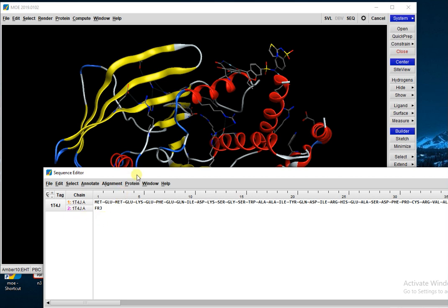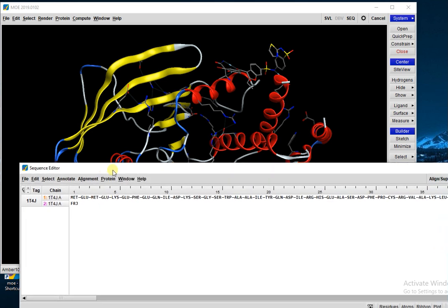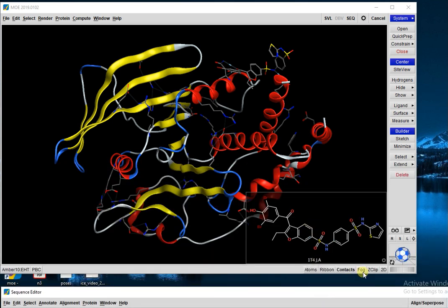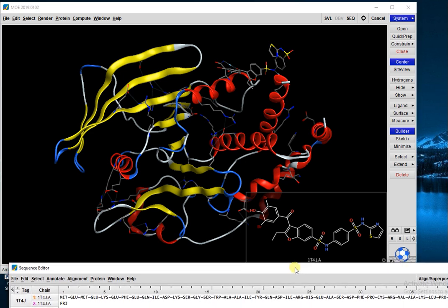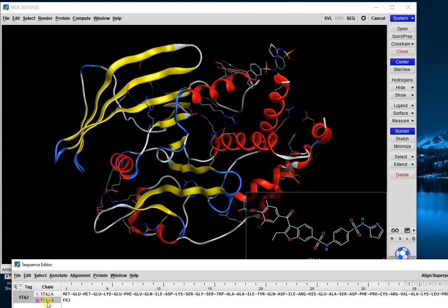Next, go here to 2D. This is already shown. If not shown, then simply check 2D. If there is only one ligand present, then it's okay. If more than one ligand is present, then you simply remove that ligand that is not compatible or matched with your synthesized compound. Here is only one ligand, so I leave it as it is.